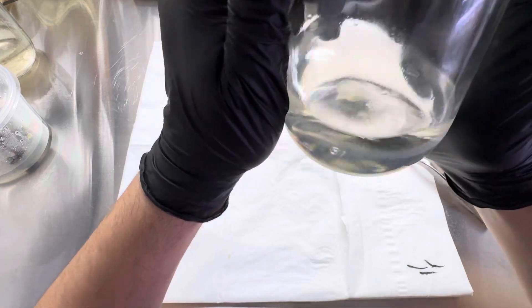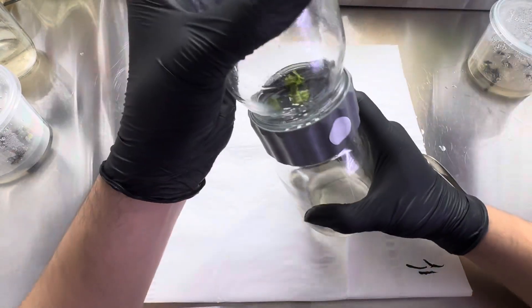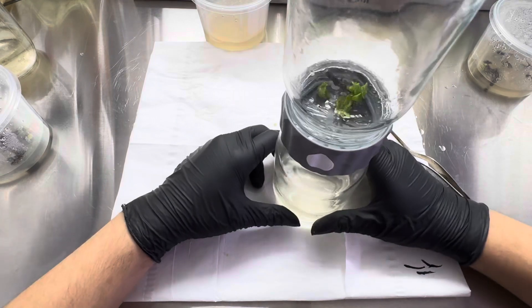You can see there's some bits and stuff, but not contamination. So, just a quick little demo.